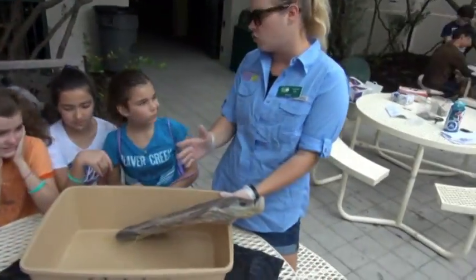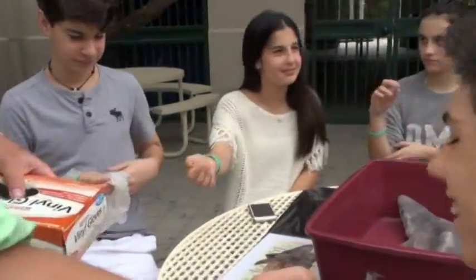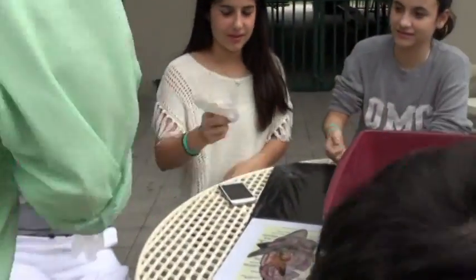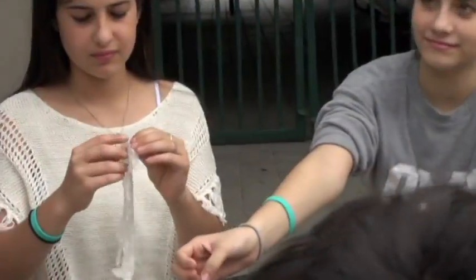That's like a 3-dimensional type camouflage. And that is not a good material for you guys to be licking off of your fingers. So, gloves for everybody. Toss them on. And when you're wearing gloves, good protocol, don't touch your face.